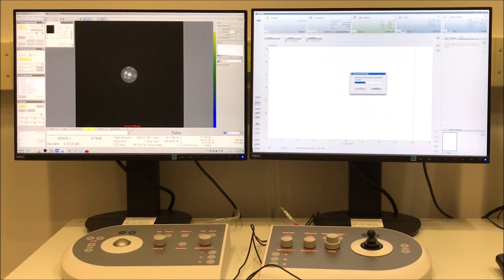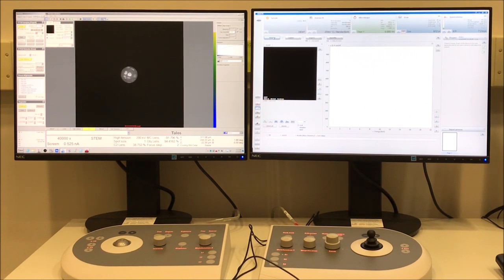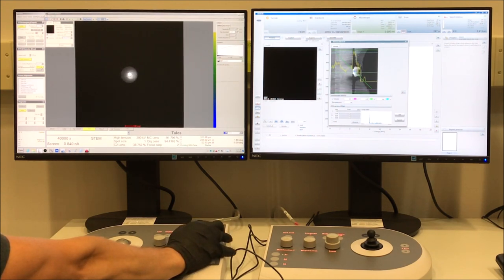And now over on the left side of the window, we see the options for the modes for the system. So this one I'm circling here, that's for point analysis. So you can go ahead and select it. Then you can select that preview button there and you see a live STEM image acquired now in the EDS software. You can turn on the scope just like you did in Velox, but now you're using Esprit 2 for this. If you need to adjust your contrast brightness, go back to the STEM detector control panel in microscope control, and you can activate the multifunction knobs using that control panel, and then you can adjust the scope in the preview image in Esprit.